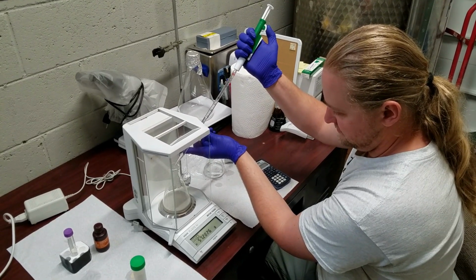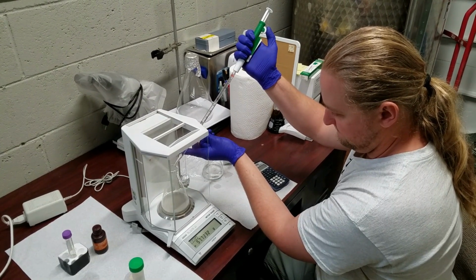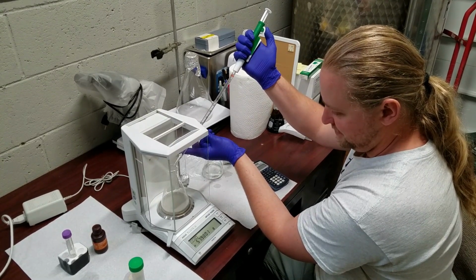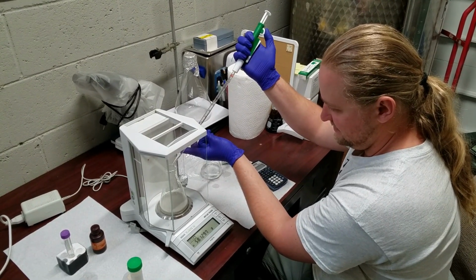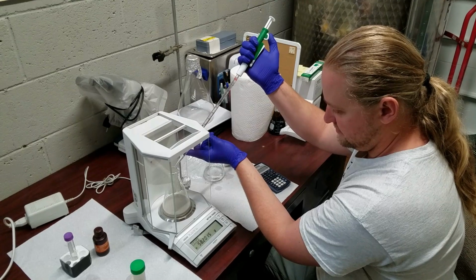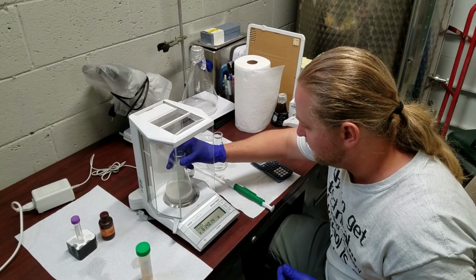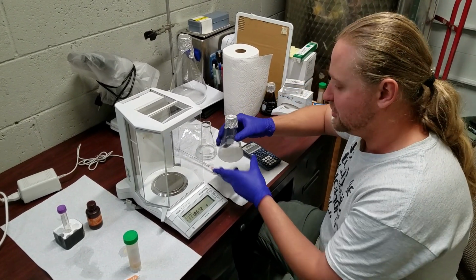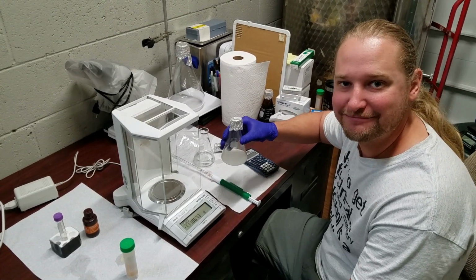Getting real close. It's kind of hard to breathe when you do this because you concentrate so hard. 58. 58.1. And 58.2 right there. So that's a 60-fold dilution. We'll take this off the scale and just gently throw a little cap on it and gently swirl it for about 30 seconds to a minute. And then I'll show you what to do after that.